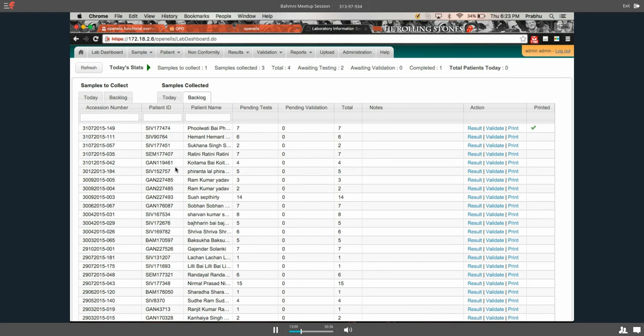But if you think time is something worth adding, we can definitely add that. I'm thinking about the sample collection time here.